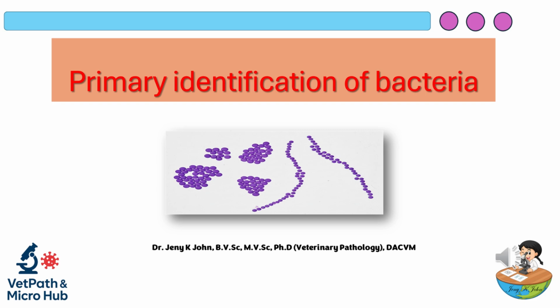Welcome to this video on the primary identification of bacteria. Once a pure culture is obtained, a few basic tests can help identify the bacterium to the generic level.